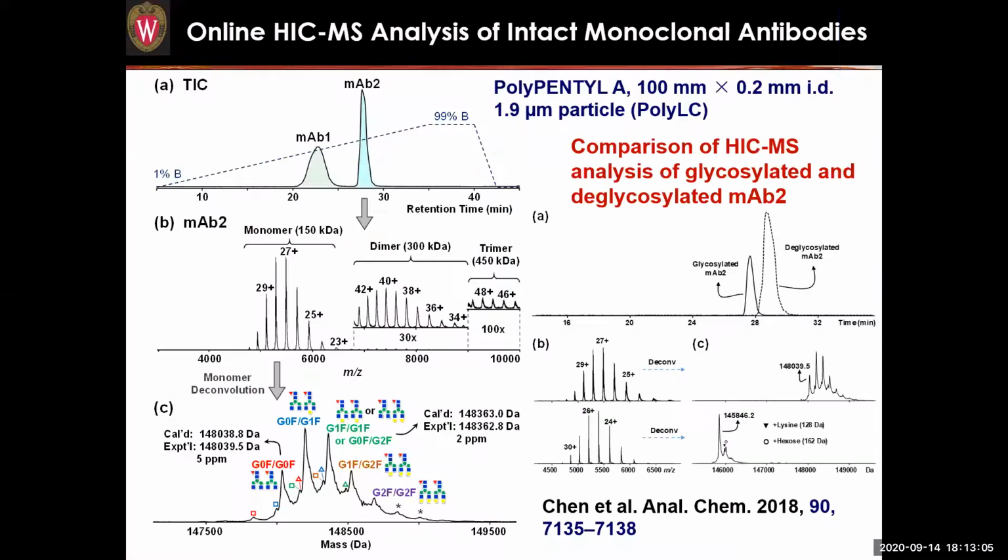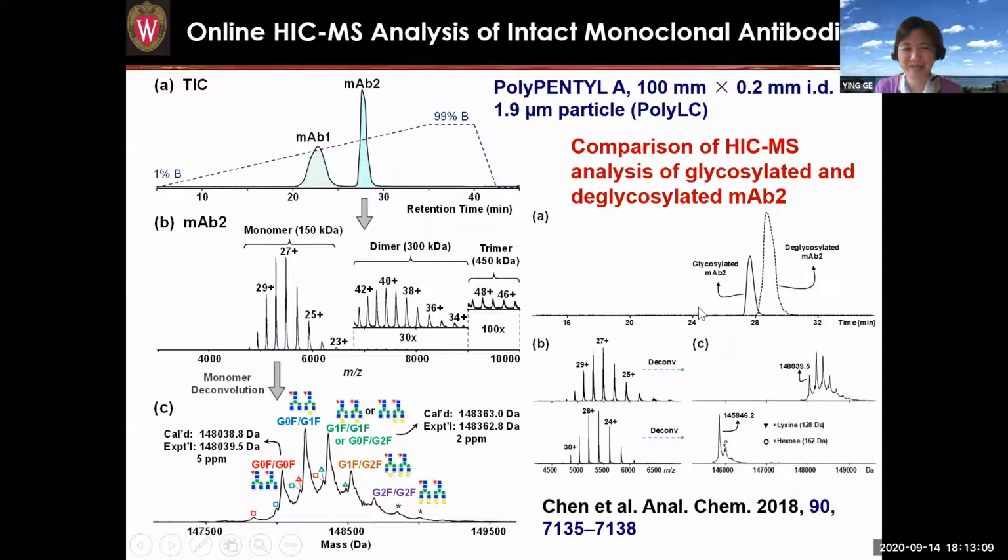These are from Maxis, so you can get these easily. This is all Maxis QTOF data. So QTOF works beautifully for intact protein analysis.